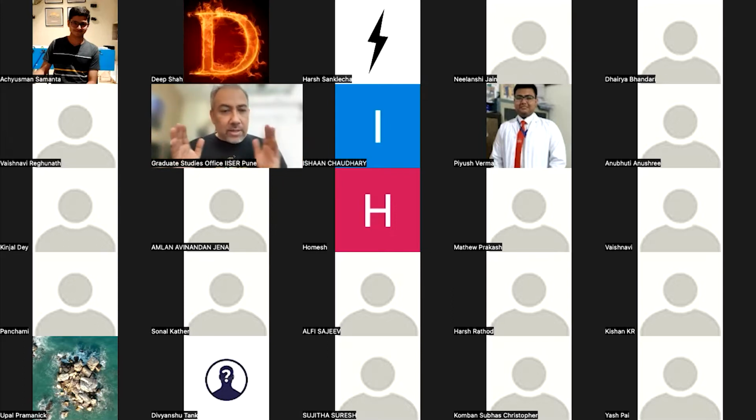But they're fraught with errors, obviously. But they also evaluate this based on different aspects, particularly, for example, what should be the bleed through, how many molecules should be present at a particular point to be able to get a certain amount of bleed through. So there is a certain set of calculations that are made with real images also to evaluate the nature of deconvolution and the quality of the outcome it generates.